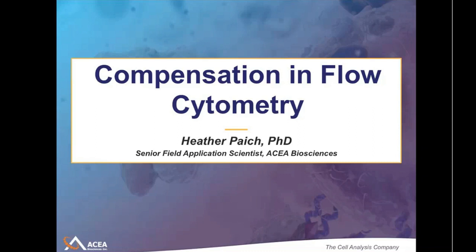I am Heather Paich, and today I'll be sharing a presentation about compensation in flow cytometry. The objective of the presentation is to share some foundational knowledge about compensation upon which you can build in the future. This presentation should last around 30 minutes, and then I'll have some time afterward to answer a few questions if you have any. You can feel free to type your questions in the chat window.